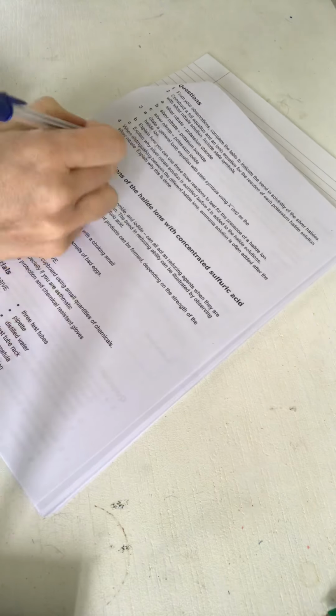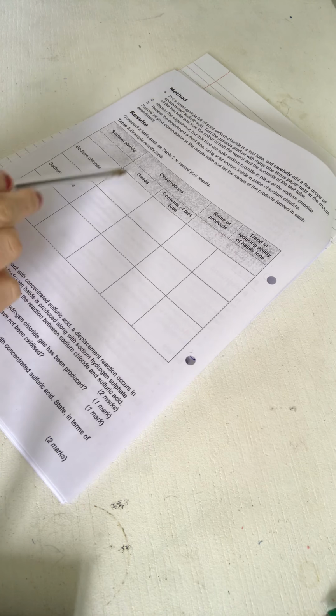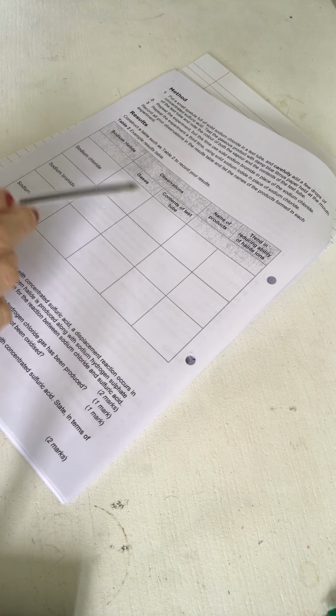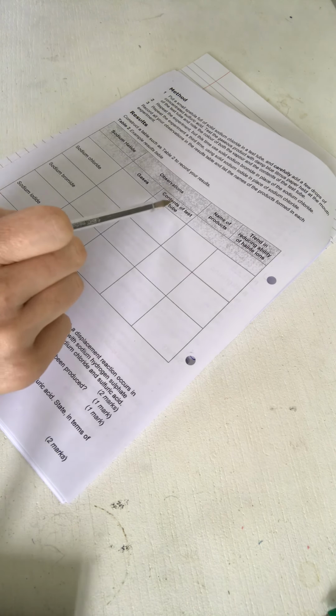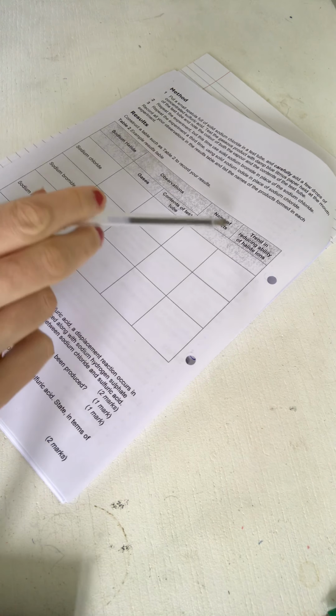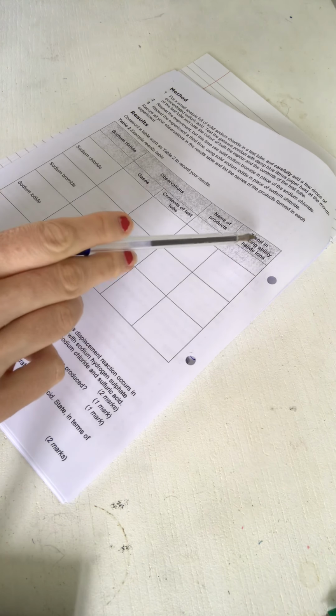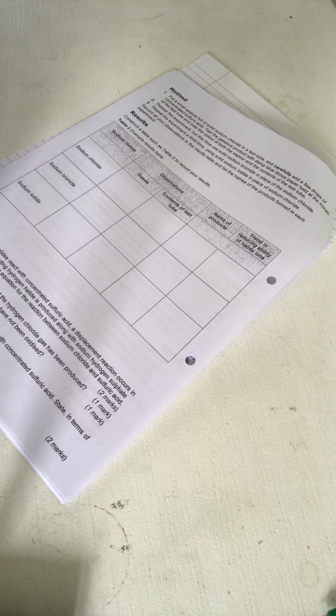Right, that is as much as I'm going to say on that. I'd like to turn to part 2 of this practical, which is the reactions of the halide ions, specifically the sodium halide ions, with concentrated sulfuric acid. Now, the results table here prompts you to write which gases you observe, or if you observe a gas, the colour of that gas, perhaps the contents of the test tube, and this is observation, so it's just asking for colours basically, or if there's any precipitates or anything like that. Then the name of the products, and from that deducing the trend in the reducing ability of the halide ions.